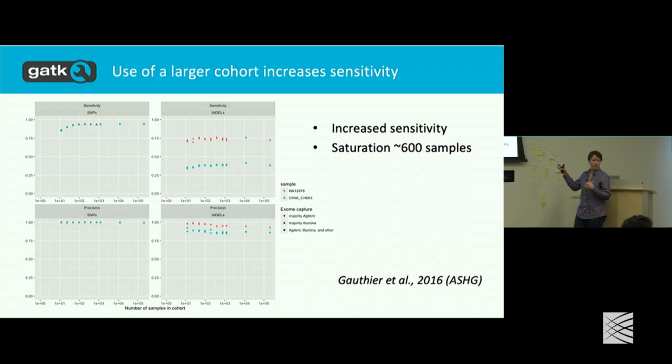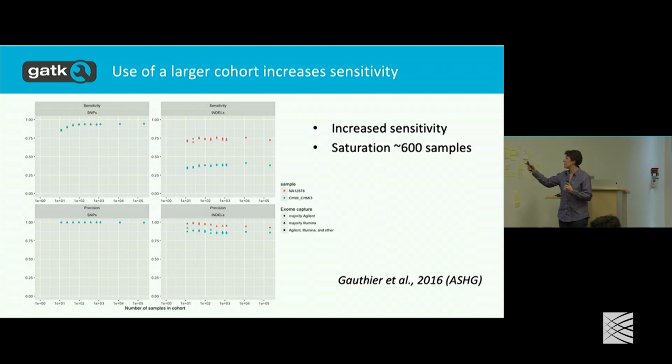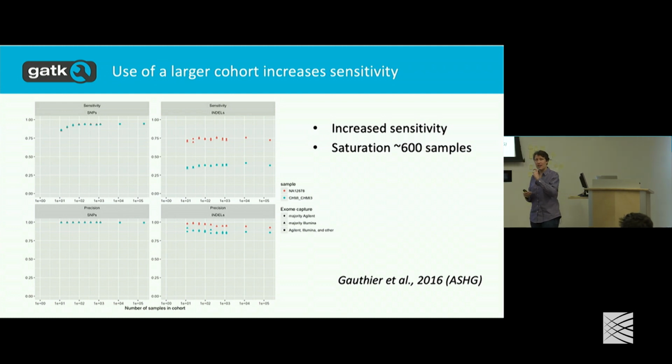One of those points was all of ExAC, and one of them was a subset. Yeah, so they're measuring across subsets. So it's basically a titration experiment where, measuring on increasingly large subsets, you can see that you saturate around a few hundred samples, and then after that, the gains get more and more marginal.